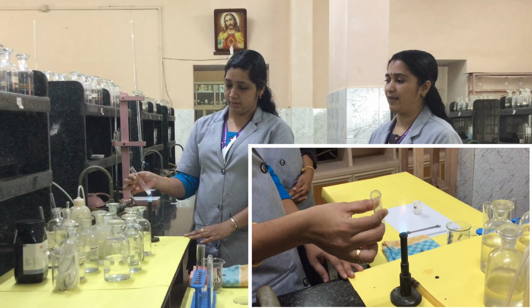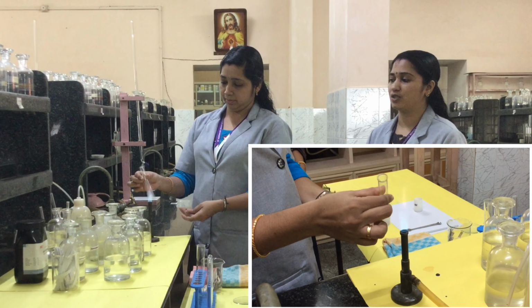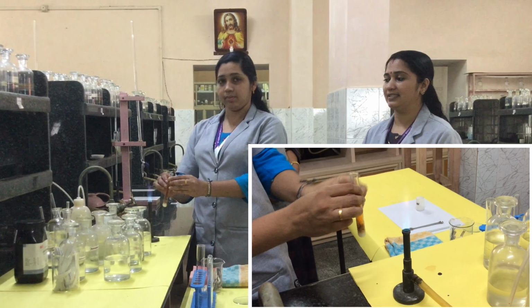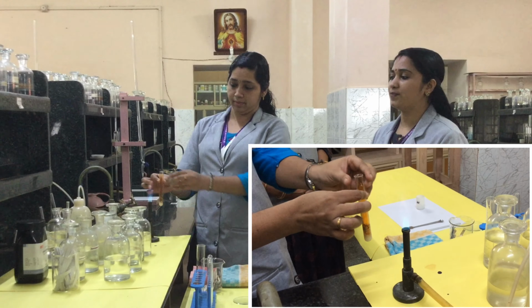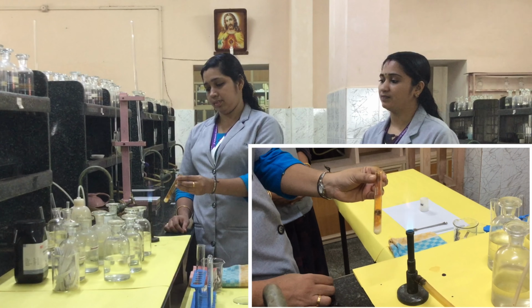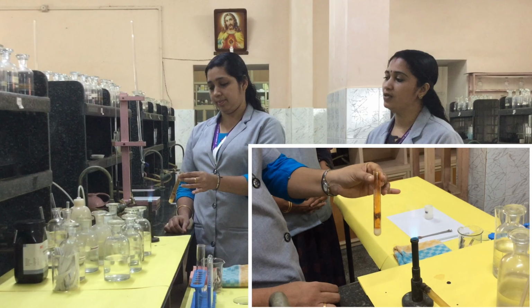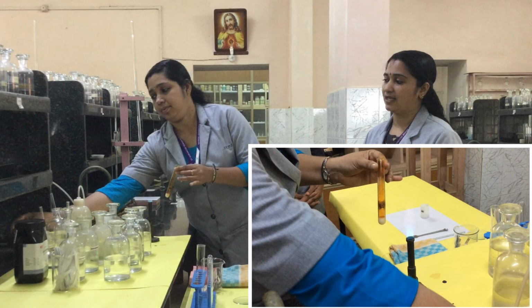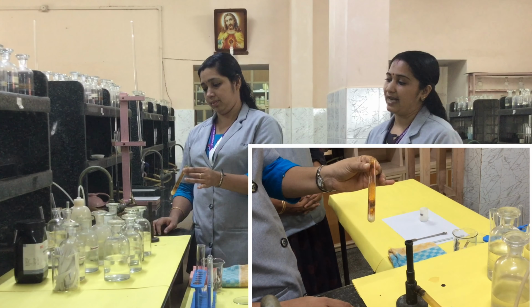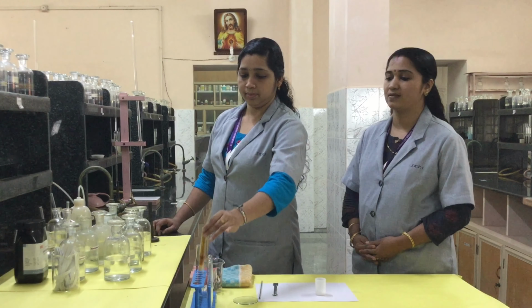So chloride is absent. Now you have to add paper pellets to the boiling solution for testing nitrate. Just add the paper pellets, then heat the contents. You can observe a brownish gas evolved. Reddish brown vapors evolved. So the test for nitrate is positive, showing the presence of nitrate. We systematically analyzed the presence of nitrate. Then we have to confirm the presence of nitrate.